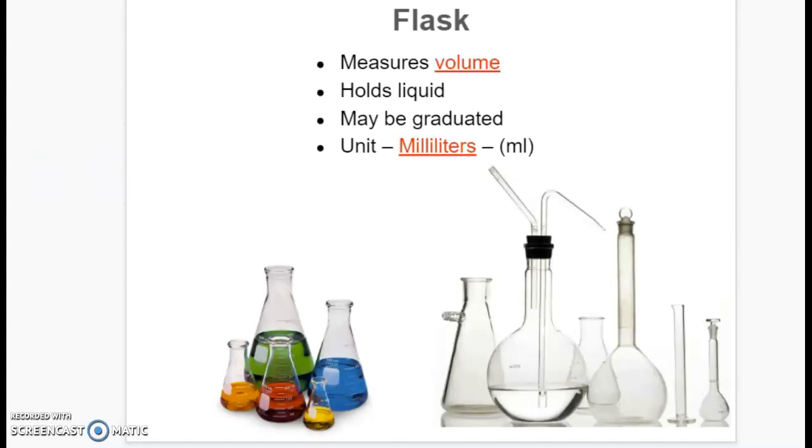Okay, we're going to start with a flask. A flask measures volume. It holds liquid. It may be graduated, and the unit it measures in is milliliters. And it's liters, not meters, because we are talking about liquid volume. So milliliters. You can pause after each slide to let everybody get caught up with their notes.